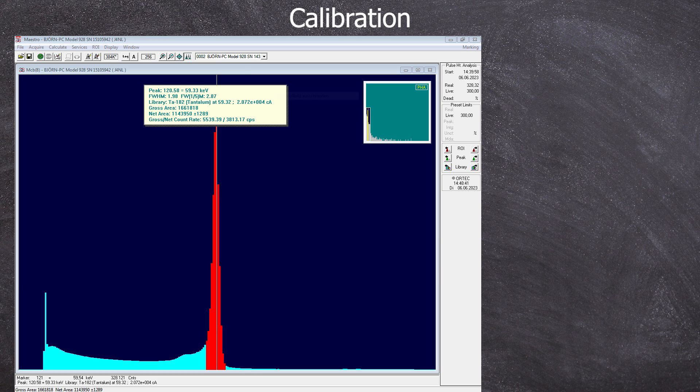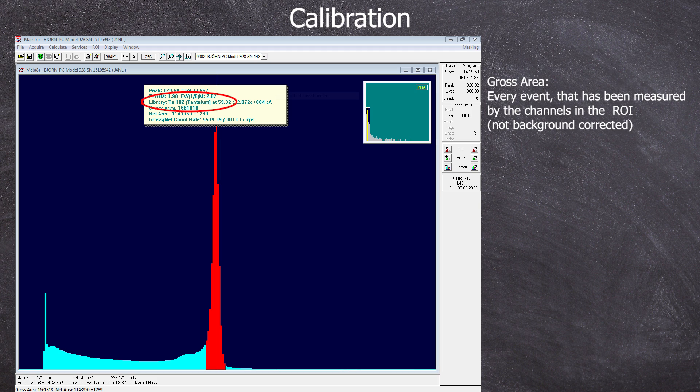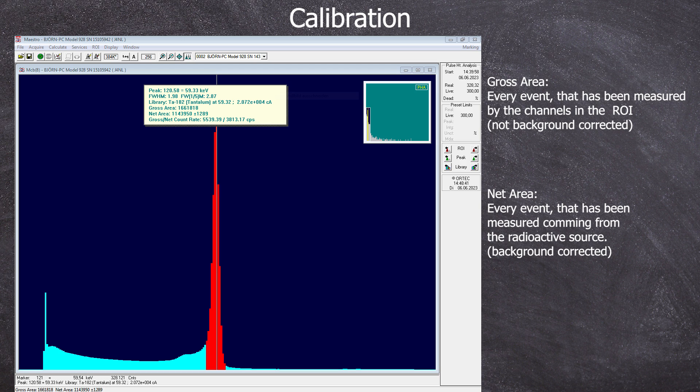For the efficiency calibration, you will need to mark the peak in the region of interest and click on it. The database identifies our Americium as tantalum-182, which we can ignore. What interests us is the gross and the net area. The gross area describes the absolute number of counts measured in the channels in the ROI, while the net area represents the background corrected counts that came from the channel in the ROI.